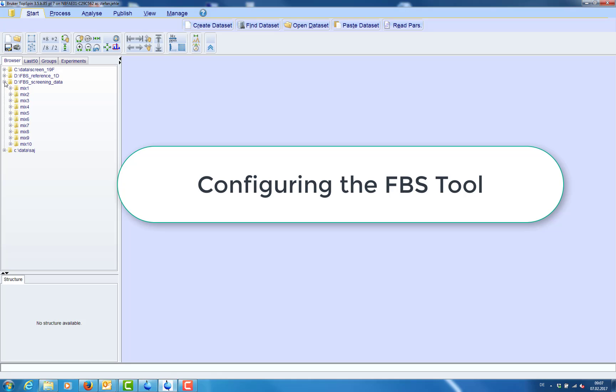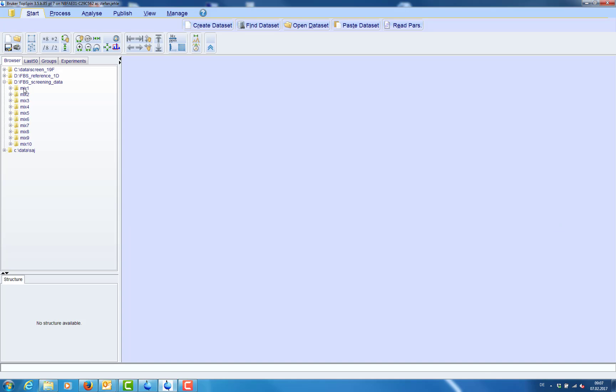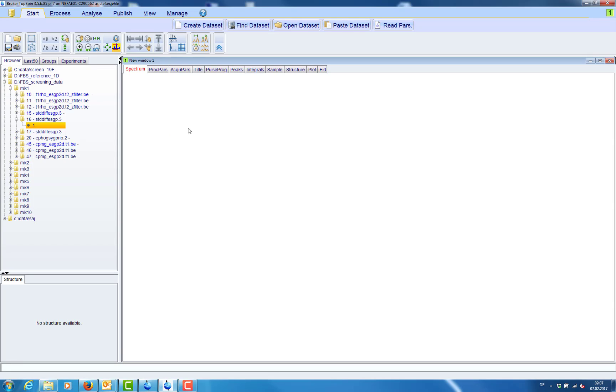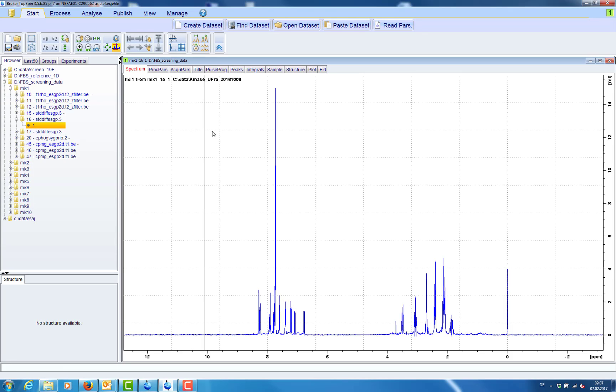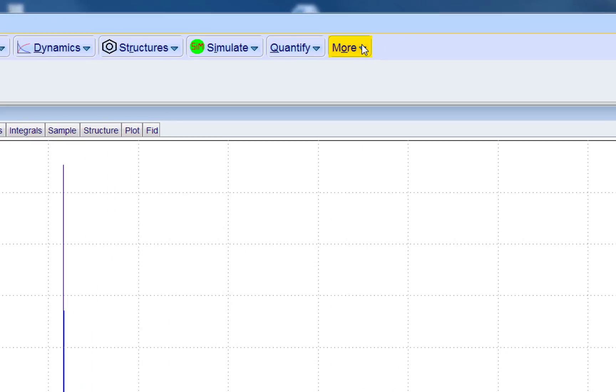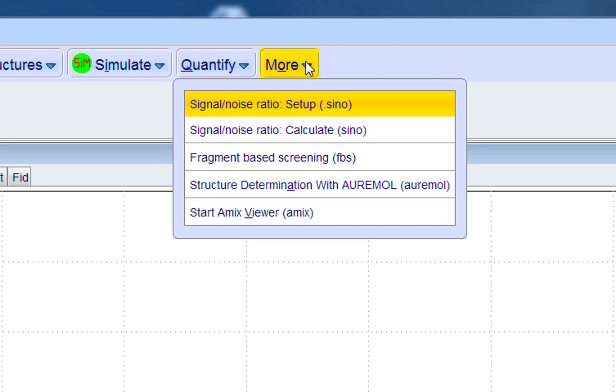After our screening data have been measured, we navigate to the folder where we have our screening experiments, open one screening experiment, then we can open the FBS analysis tool from the analysis menu.